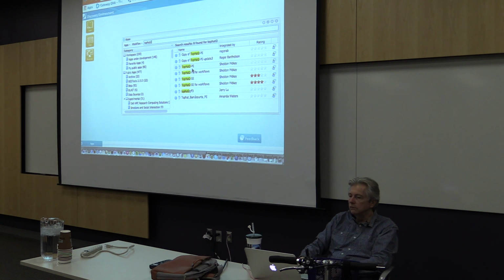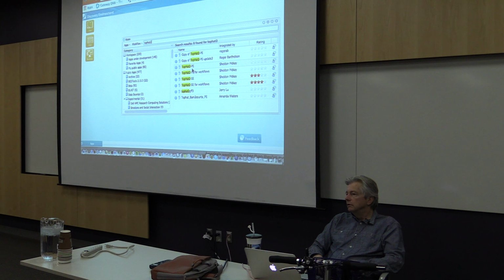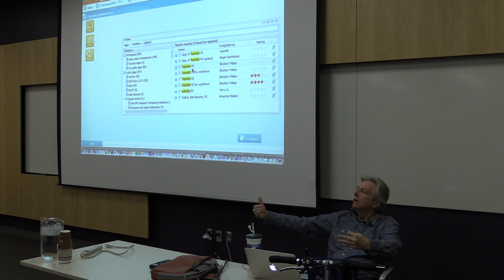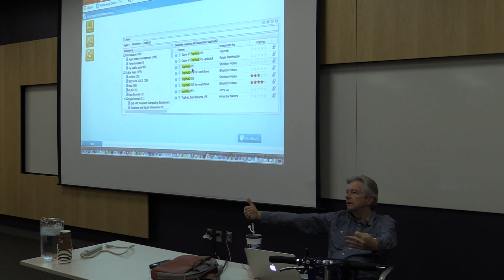So that is really a lot of how people are able to extend the size of their assemblies, and it's especially important for genome assembly. Not as much for transcriptome assembly because the sequences are often smaller, but it's still helpful if you really want to get a full sense of your transcripts, but also it gives you more reliable information. If you look at only what's mapped, when you're looking at paired end reads, when both ends are hitting the genome in the same place, then you can very securely say, okay, that's where that's supposed to map. Because you have not only 100 bases here, but 100 bases here mapping at the same time to that spot on the genome.